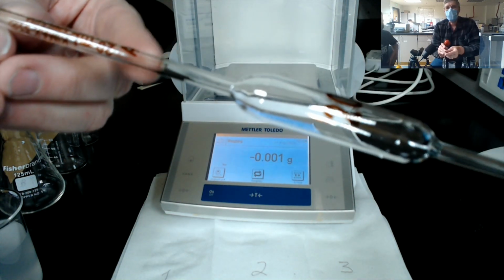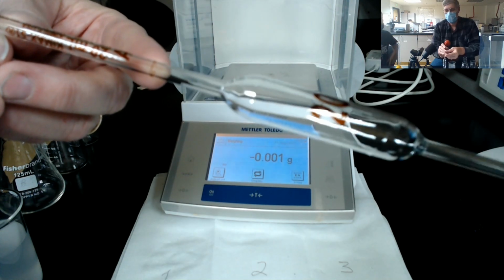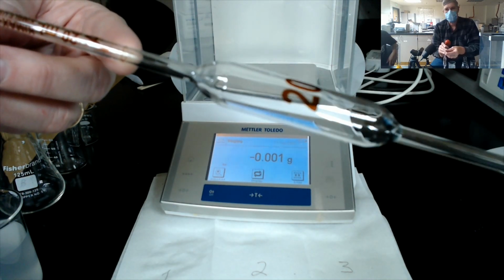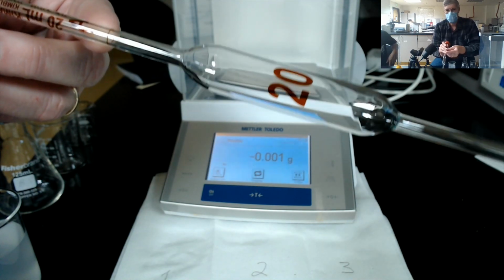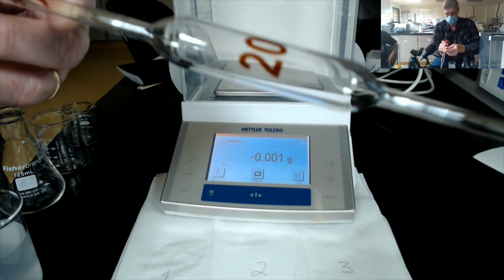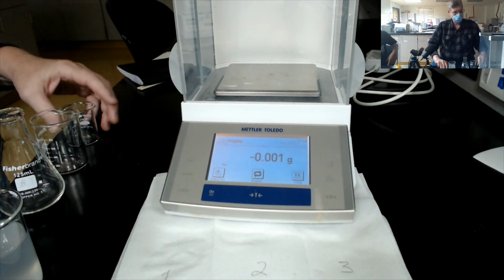Now the one line on a volumetric pipette is right there in front of my finger. That is the drainage line that, if you use it correctly, this pipette will deliver precisely each and every time 20.00 milliliters. So we're going to use this pipette 3 times to deliver 20.00 milliliters into 3 different containers.